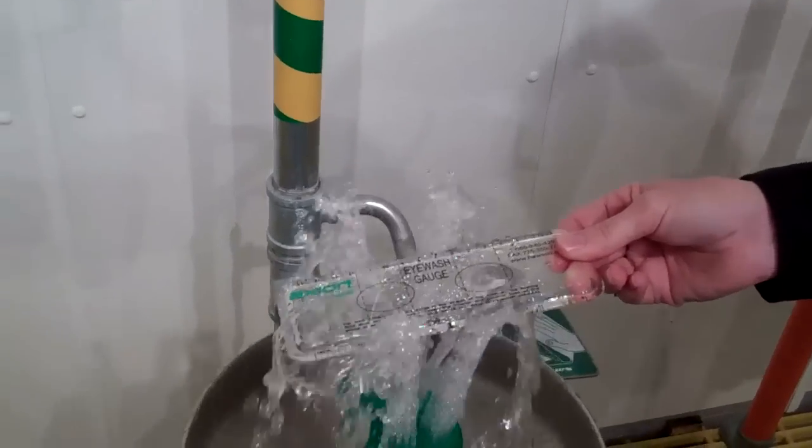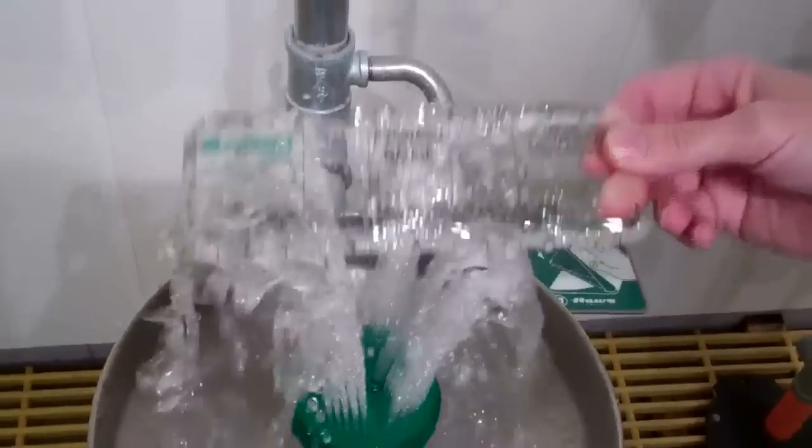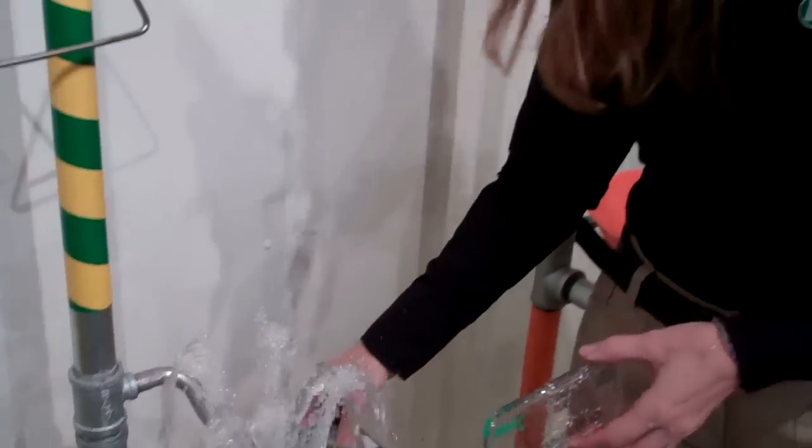You just want to make sure though when you're testing that the flow is proper. If you have any questions, you can go to www.Hosco.com or call us at customer service. Thanks.